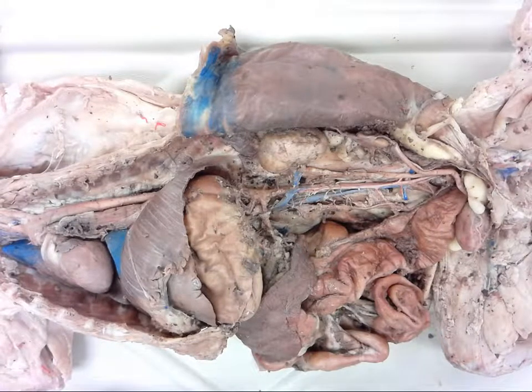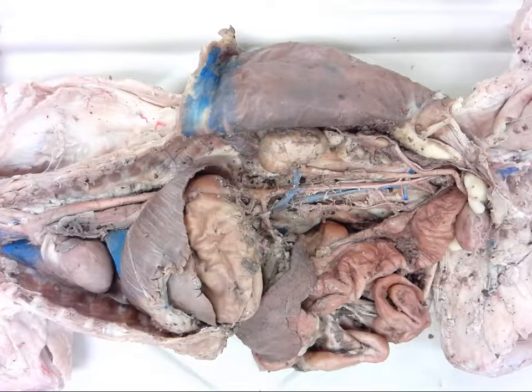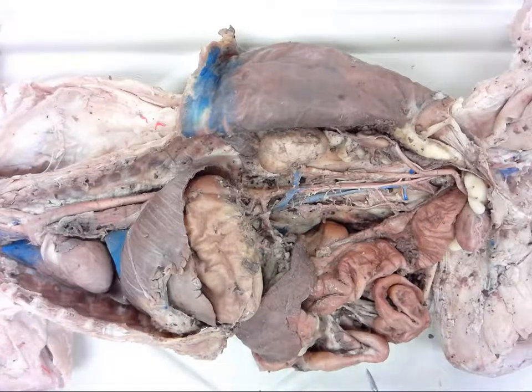And I would like to point out that this cat was very well dissected by Khalil and Max, so give them a little credit for the work that they've done, and they'll get to live on in infamy in this video. So, while the contrast of this specimen isn't great, the colors are a little dark, I'll try and draw things out as best I can and zoom in as much as possible throughout.